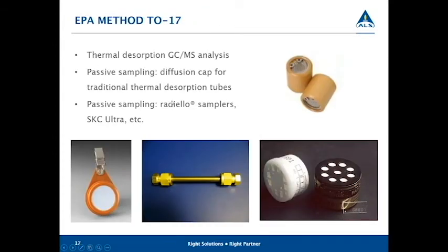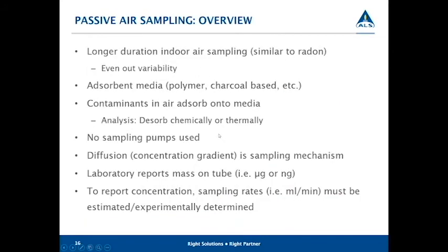Hi, Josh. This is Nicole. Before we move on, could you go back to that slide? I think there's some more current information that we can share with our colleagues on this. It has been in the past that they did report mass on tube, but it's very common now for the passive samplers to report concentrations. So the concentration is a function of the uptake rate, which has to be provided by the vendor, but almost all vendors now have those uptake rates, which allow laboratories to routinely report concentration.